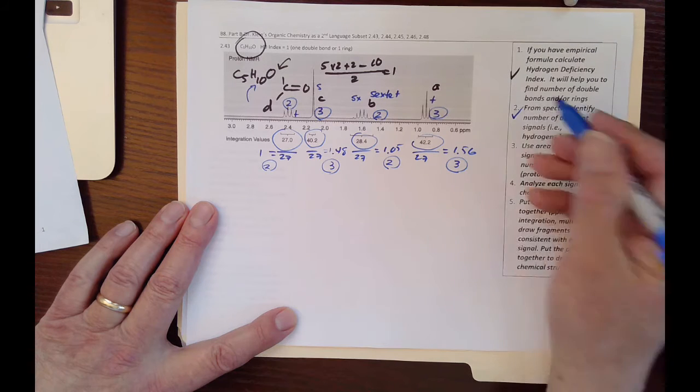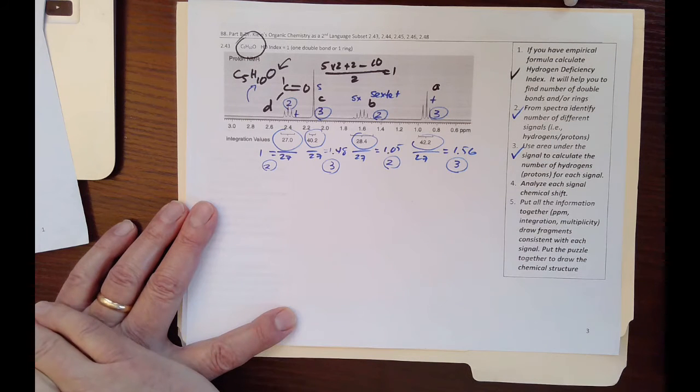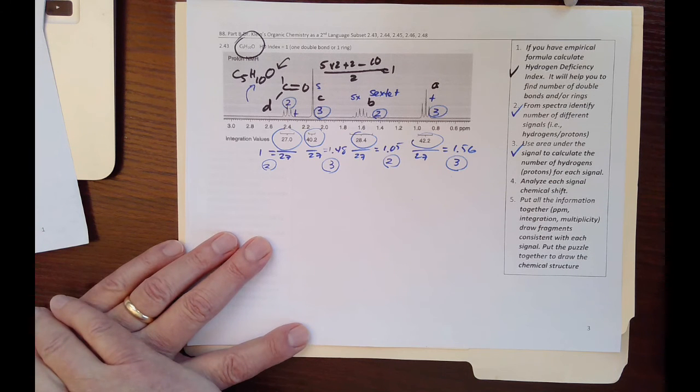So we did that. We did the area count and identified the number of hydrogen for each signal. Now the next step is to look at the ppm, the number of hydrogen, and the splitting pattern. For example, the first one is a triplet, right?